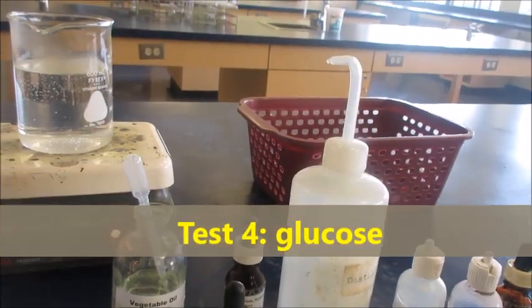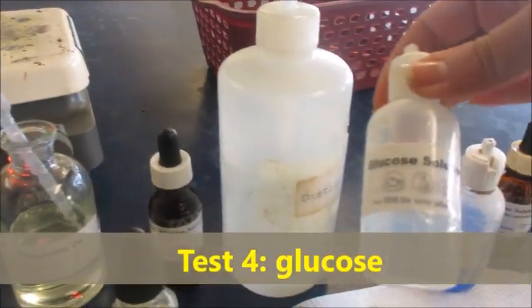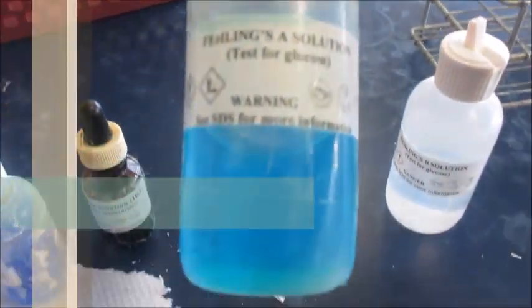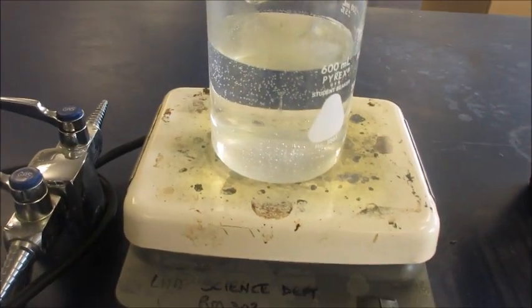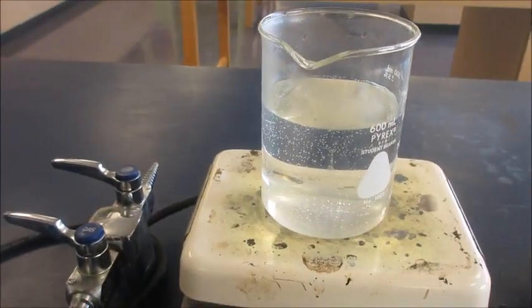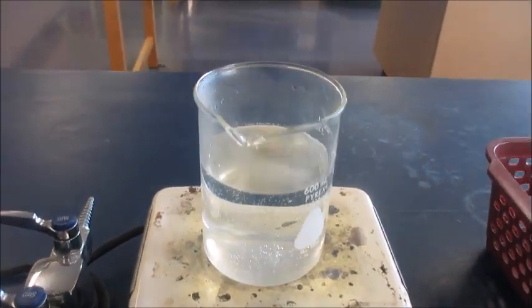For this last part, we will be detecting simple sugar, or glucose. We will be using two reagents: Fehling's A and Fehling's B solution. For that, I will have to use a hot water bath, which has been heating from the beginning. Once I'm ready, I will place my test tubes inside the beaker.